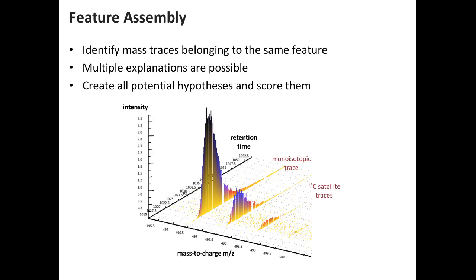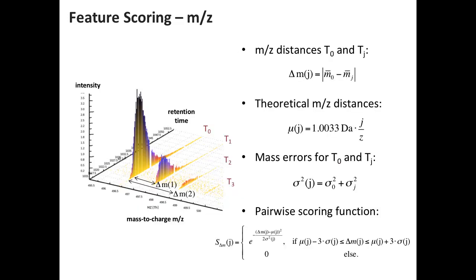Now, as I said, we don't have an averagine hypothesis. So in contrast to what we can do in proteomics, where we test these hypotheses, that trick no longer works for us, because we would discard the majority of these isotope profiles. They will have very different intensities. So what can we do? We can still hypothesize what should go together. We just need a different type of scoring function.